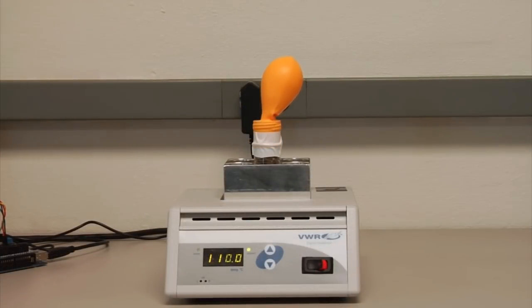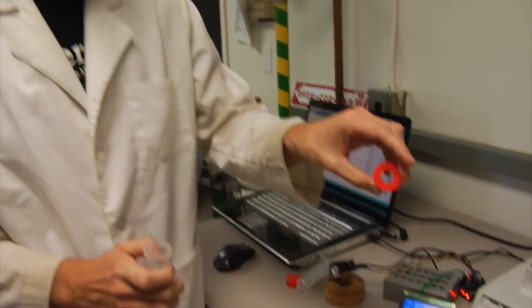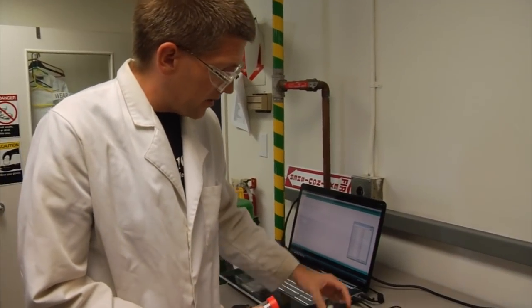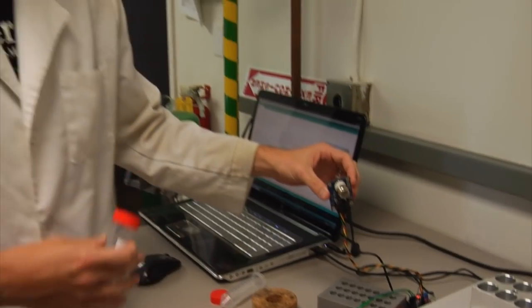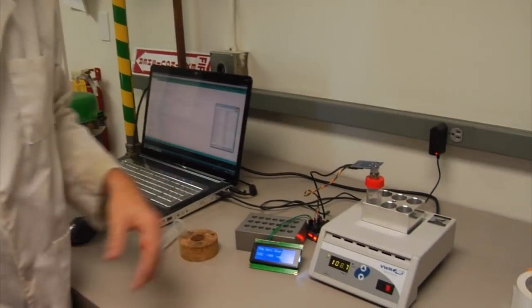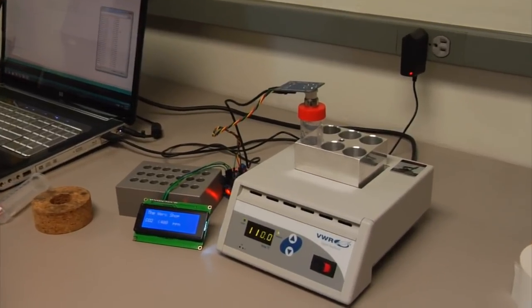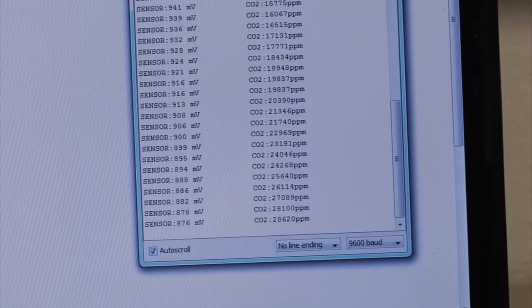The THC acid will slowly convert to THC and CO2 gas will be released. On another tube we're putting a cap with a hole and a CO2 sensor that fits right into here. This sensor is very selective for CO2, so it will respond to the amount of CO2 in the air in the tube. That way we can prove that CO2 is actually generated when cannabis decarboxylates, and the computer logs it every second so we can draw a nice graph afterwards.